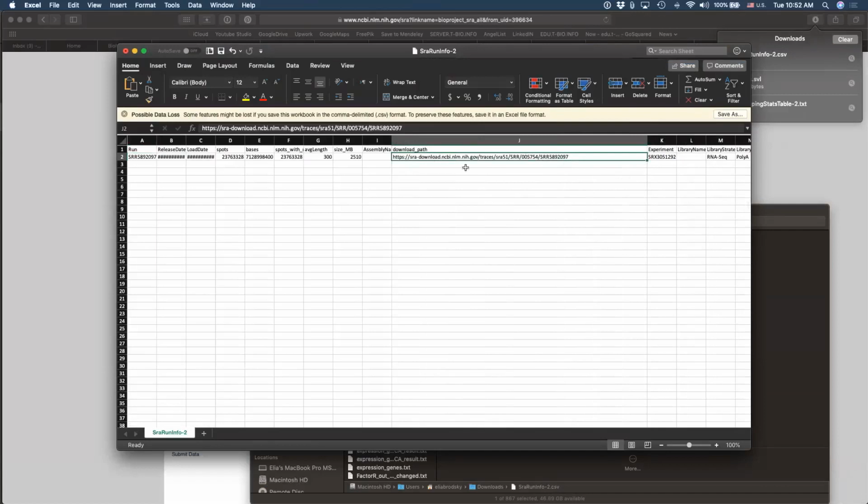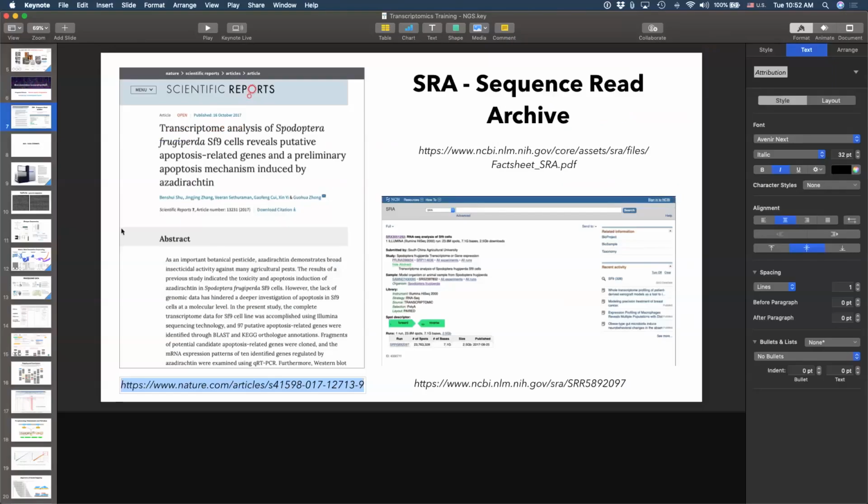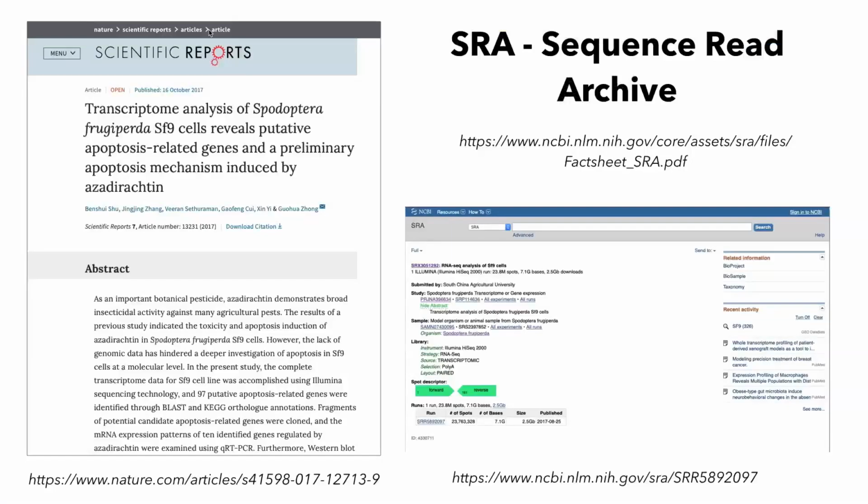Okay? Don't try to use this link on the platform itself, but whenever you're preparing your project and you plan your analysis, include this link in your analysis plan. That way we can pre-upload it on the repository and make it available for you. Unfortunately, just like this, it is not going to work because it is not a direct link to the SRA file. It's just a link to the folder where the SRA file is. So we'll have to still upload it onto the repository. So this is a little overview of where this data came from and how to know whether this is clean data or we need to do some pre-processing.